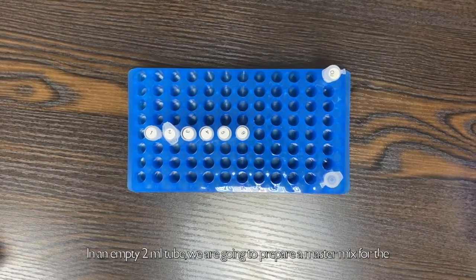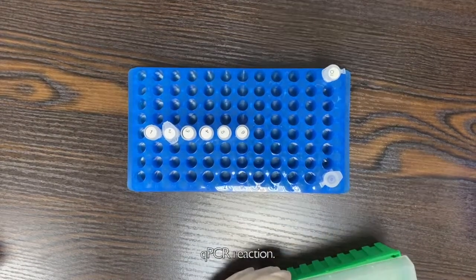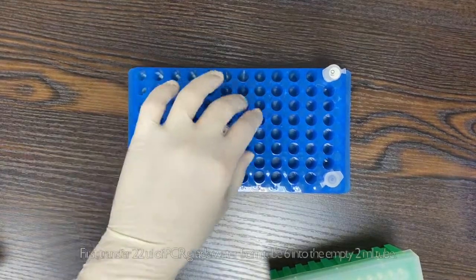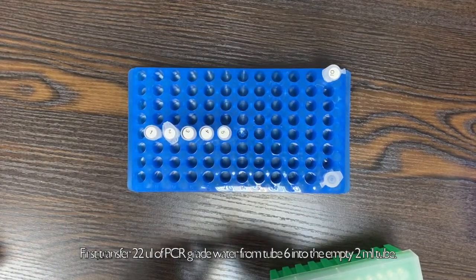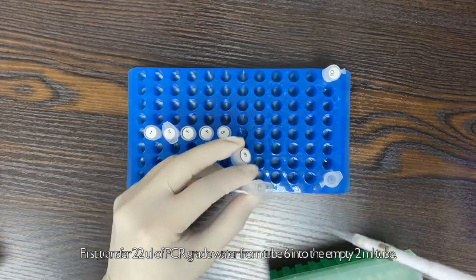In an empty 2ml tube, we are going to prepare a master mix for the QPCR reaction. First, transfer 22 µl of PCR grade water from tube 6 into the empty 2ml tube.